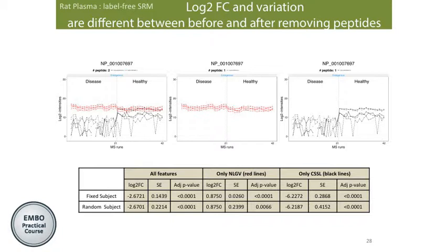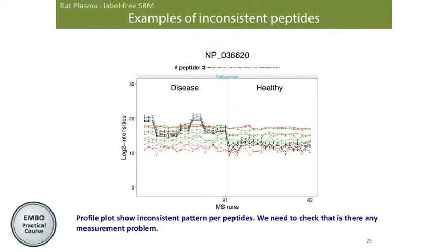If you use only the red one, you get positive log fold changes. If you use the black one, it's a really negative number, and if you combine the two, it's another different number. If you do not check this quality and just take the number, it will probably be wrong. That's why we need to double check your visualization before you start the analysis.